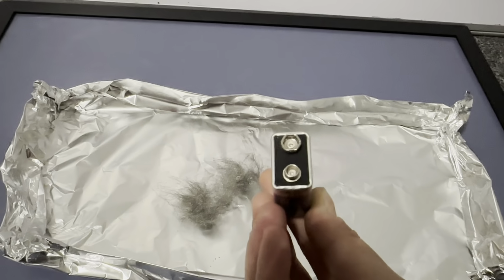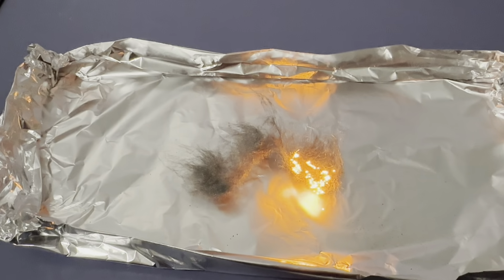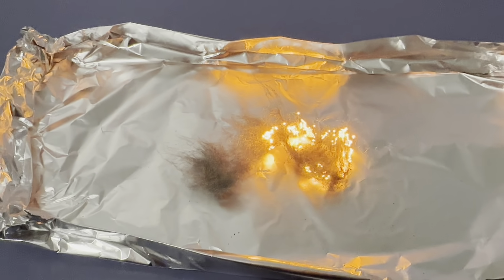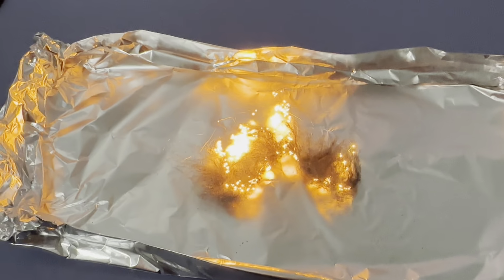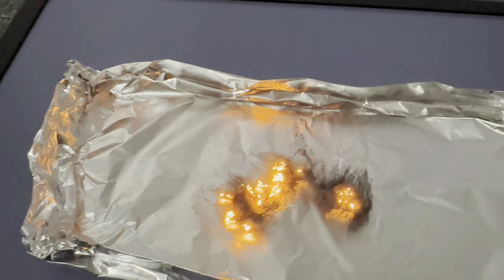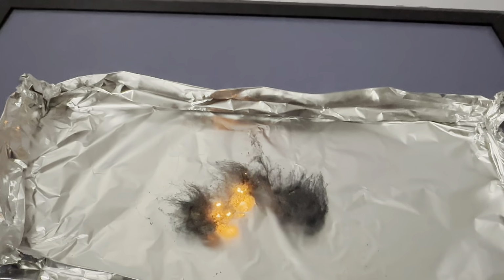So I've got my battery. I've got the leads on the battery, the positive and negative ends. I'm just going to bring it close to my steel wool, and you'll see it start to react. The more oxygen we have that can get in there for this reaction to happen, the quicker it's going to happen. And you'll see those little fires going through the whole thing of steel wool. If you have a big wad of steel wool, it's okay if you touch the battery to it in a couple of different places. Just know that this stuff likes to spark away. So if you have it going pretty violently, some of your product is going to fly away and get caught, especially if you have a fan on above it.